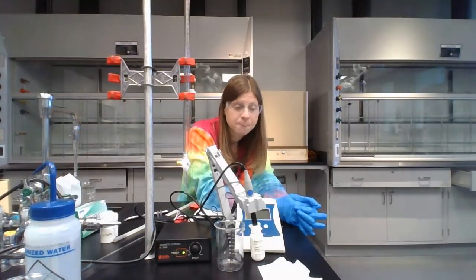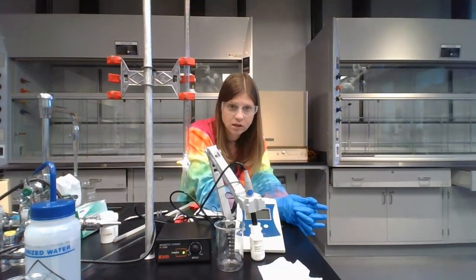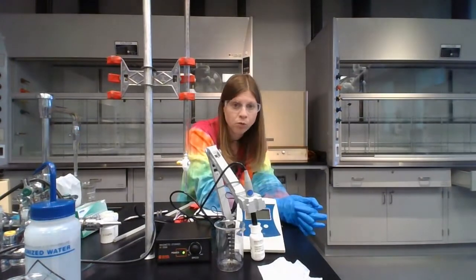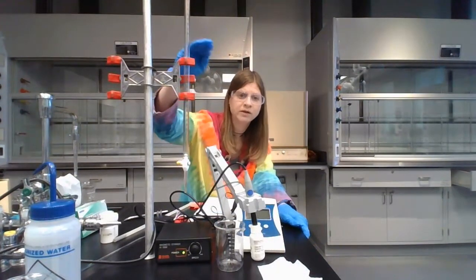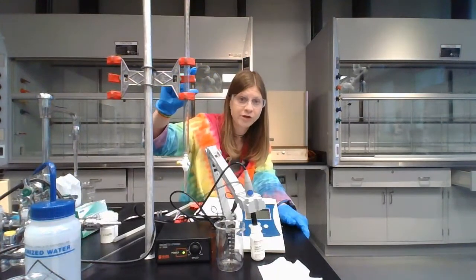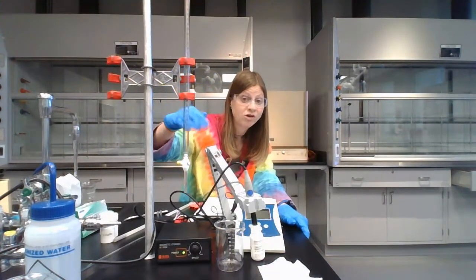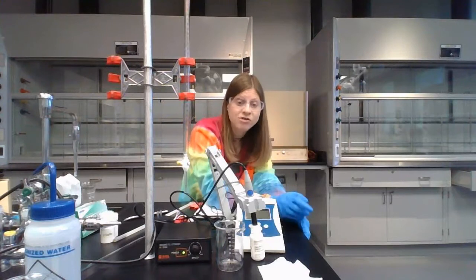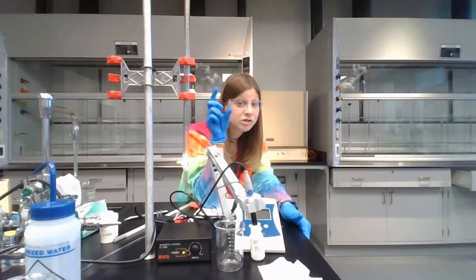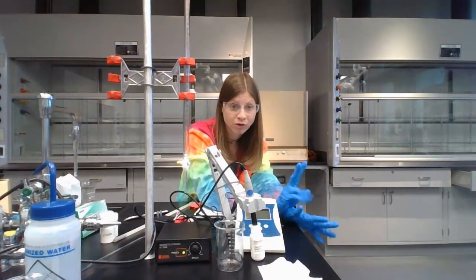An important thing here: do not jump straight from 0 to your 0.1s. You still have to do 1 milliliter increments until you get to that equivalence point range, and then you'll do 0.1 milliliter increments, and then you'll go back to 1 milliliter increments. If you just skip straight down to the equivalence point, you're going to be a super duper sad panda, because you're going to need data in that in-between spot. That's actually some of the most, we have two important numbers.